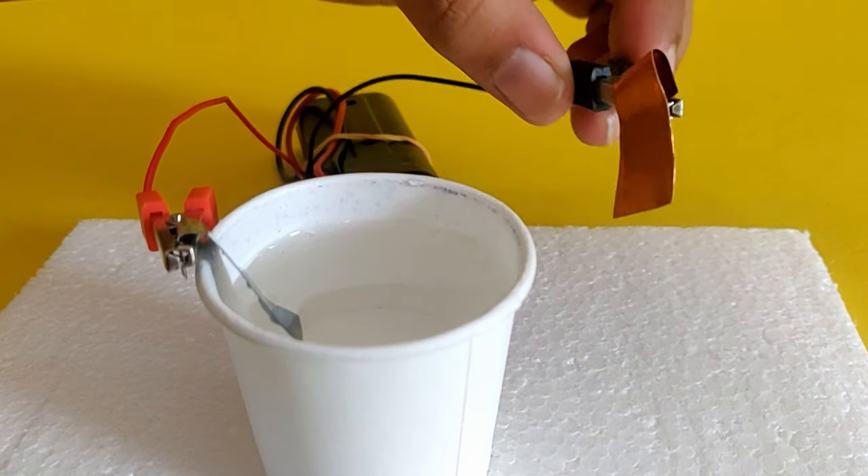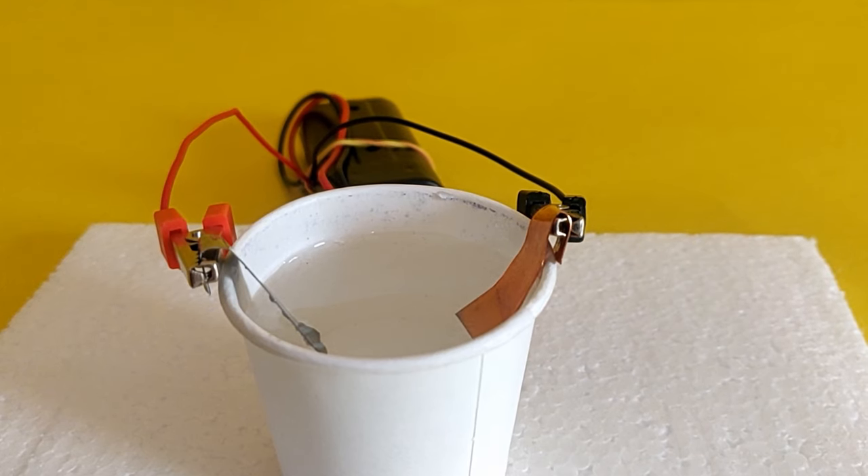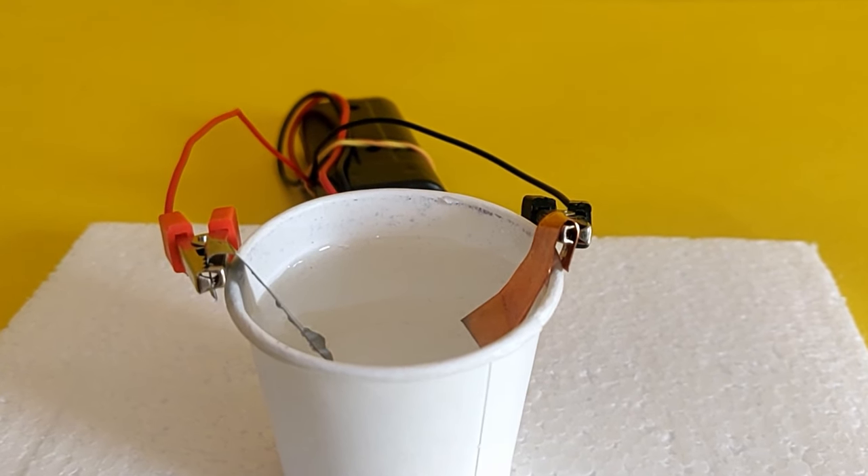Now we will replace the iron nail with a copper strip and repeat the experiment.